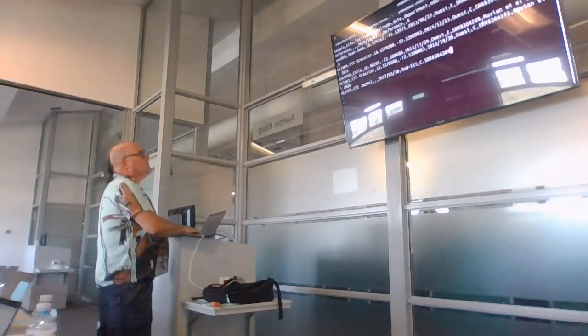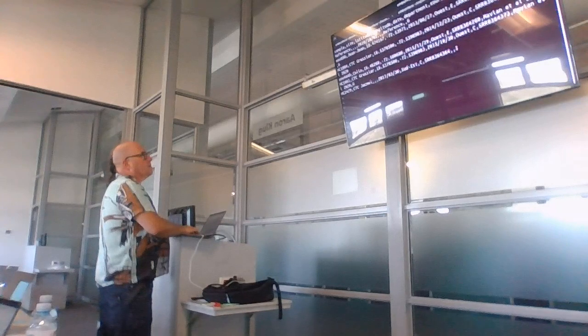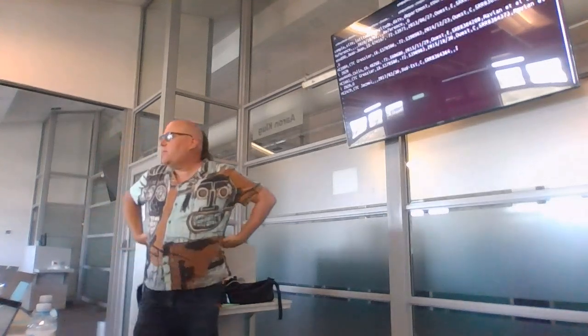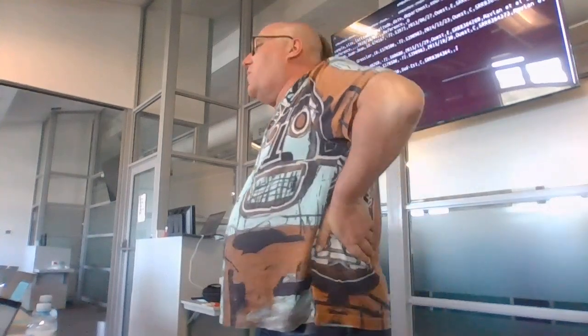So 260, there's 364, that's comma, that's Inaba, this one. What I'm doing is I'm annotating manually based on my grep, but I could automate this with a bit of extra effort.